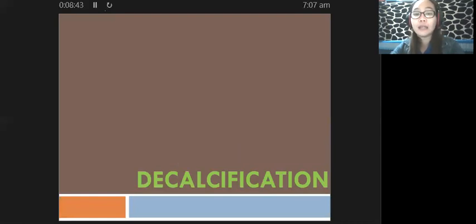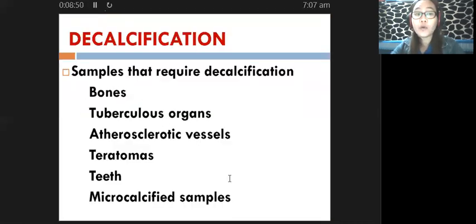Yes. So what are the different samples which would require decalcification? We have, of course, our bone samples. And of course, we have our tuberculous organs, atherosclerotic vessels, teratomas, teeth, and microcalcified samples.